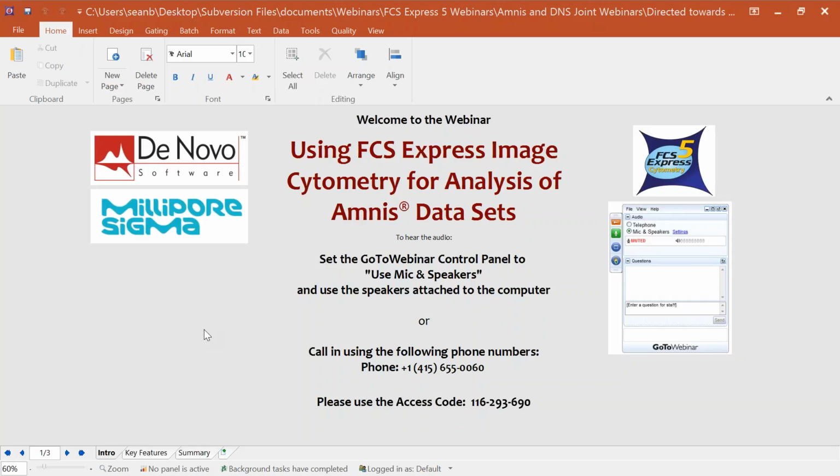We just want to take a moment here and pause to see if there's any questions from the audience about anything related to the Amnis and the imagery and image cytometry side of things. So if you have any questions, just enter them in the question and answers box. We'll try to answer them on the fly here or come back to them at the end.